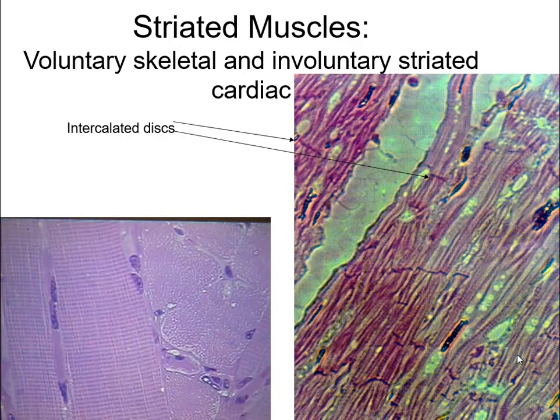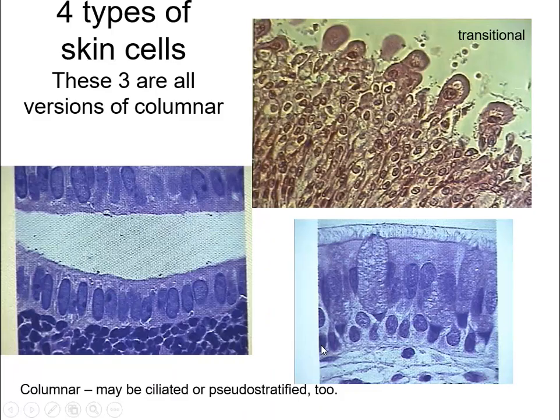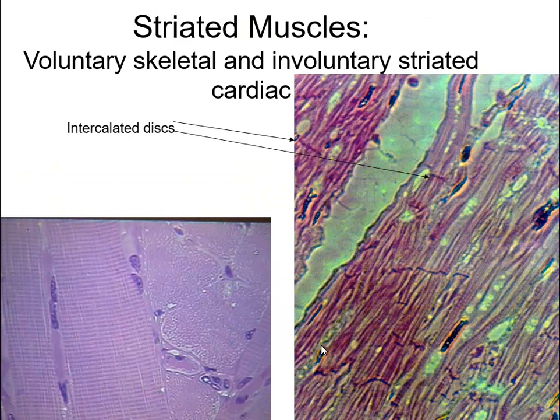Striated muscle is very easy to identify. You have two kinds: on the left is voluntary or skeletal muscle and you can easily see the lines, with the nucleus squished over to the side. On the right is heart muscle — it looks similar except you can see little lines where it looks like someone has rubber-banded fibers together. These are intercalated discs, which cause all the fibers to interact so the whole heart beats at the same time instead of a few fibers here and there.